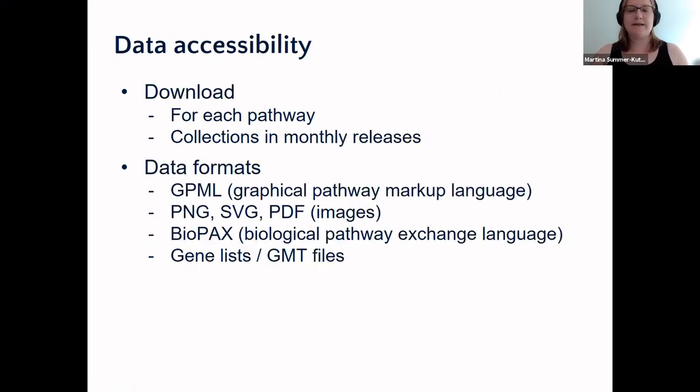You can download the data per pathway, or you can download the collections as a whole. And there are different formats from GPML to image formats to other standards, BioPAX, or now through MINERVA, you can also download them as SBML or SBGN.